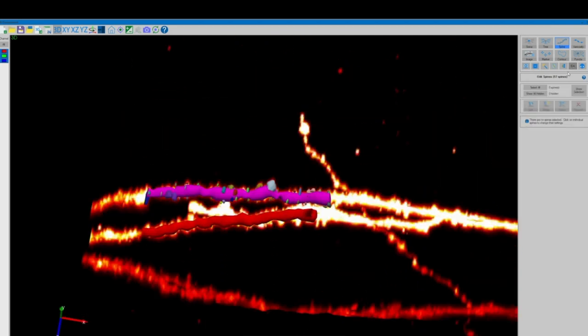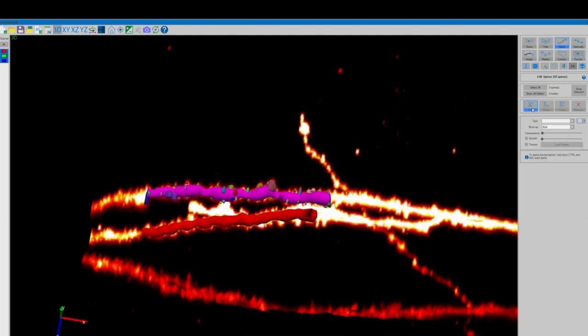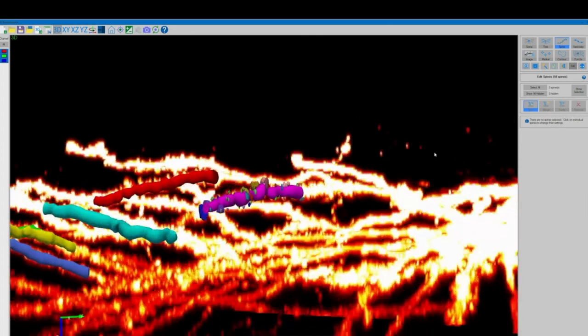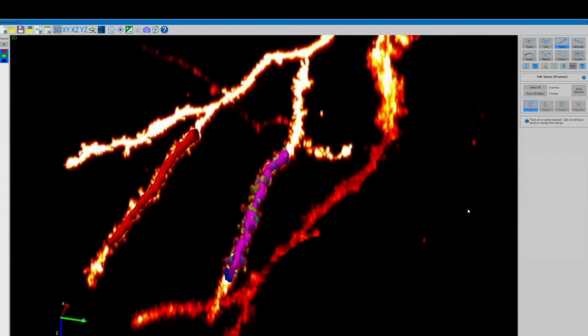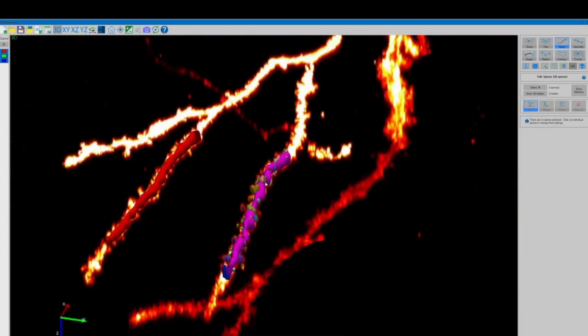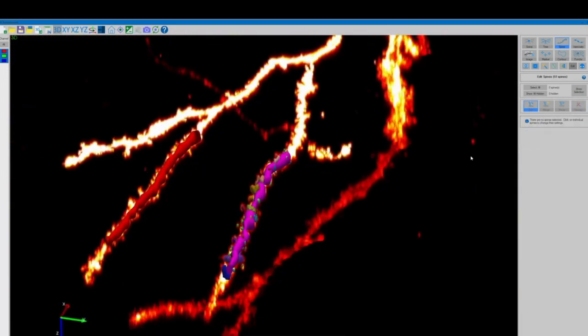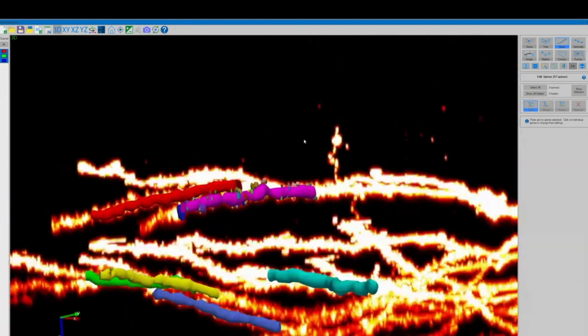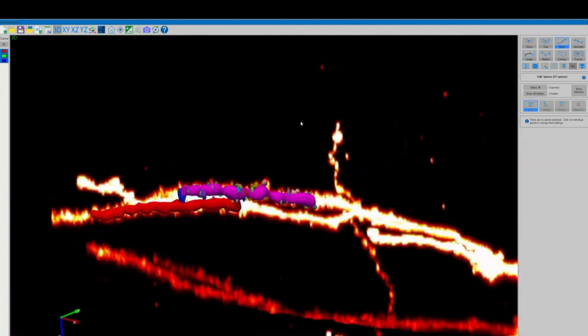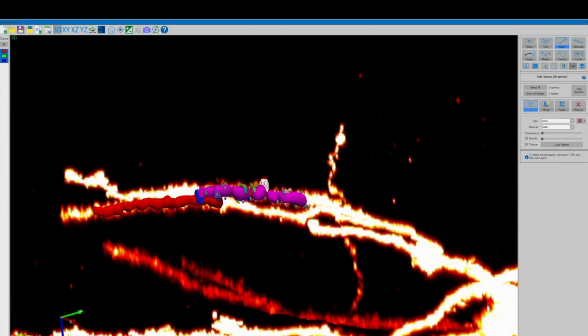Similarly to our tree tracings there are also user-friendly editing options available for spines. If the software mistakenly detected multiple spines as a single spine you can use the split tool to split this up into multiple parts. You can also use the remove tool to select one or multiple spines and remove them or you can select multiple spines that it may have detected as different structures and merge them together into one.